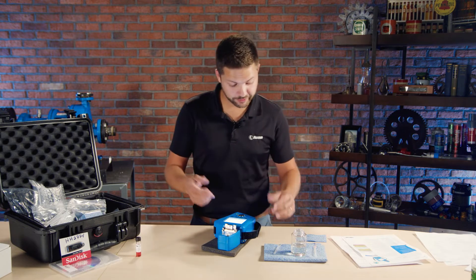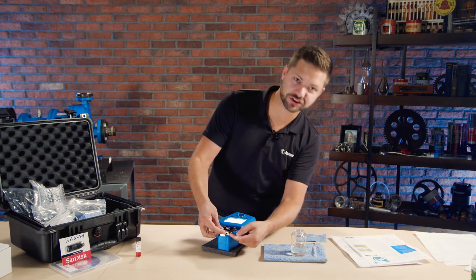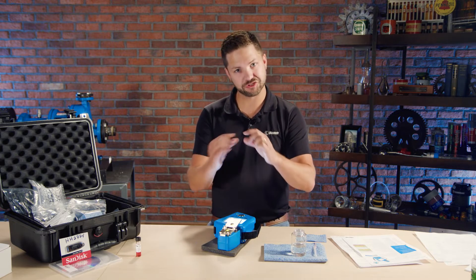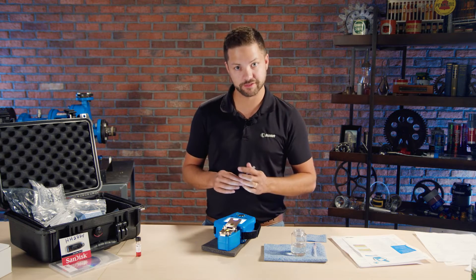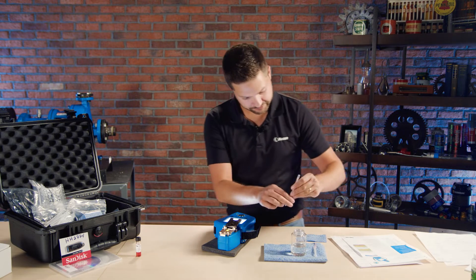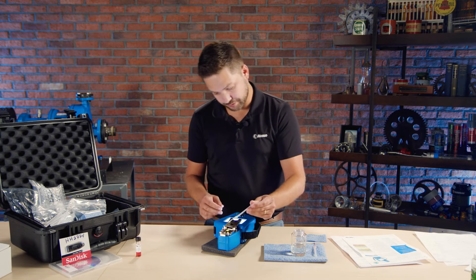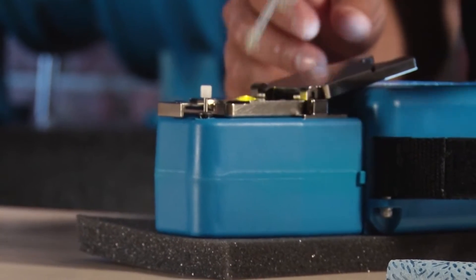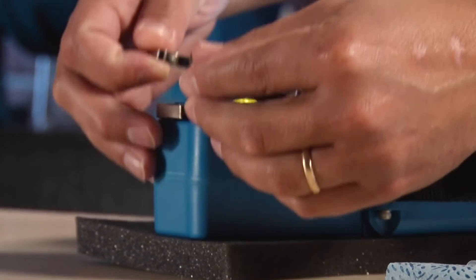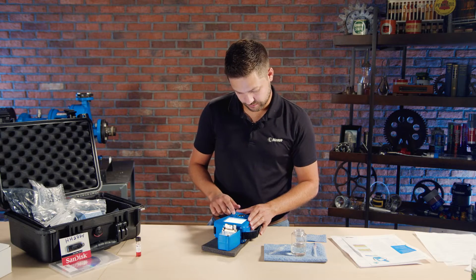I'm ready for the actual fluid now. I'm going to use one of these pipettes and open up this flip top. They have a nice little shock absorber to make sure it opens up gently, and when you close it back together there's a perfect gap — it's all very well controlled in the design. I put a drop of oil in; it was already cleaned from the reference fluid, and it's already running. No problem at all.